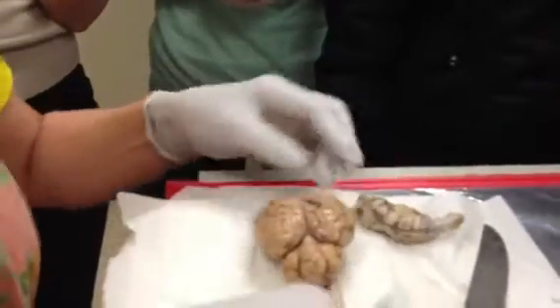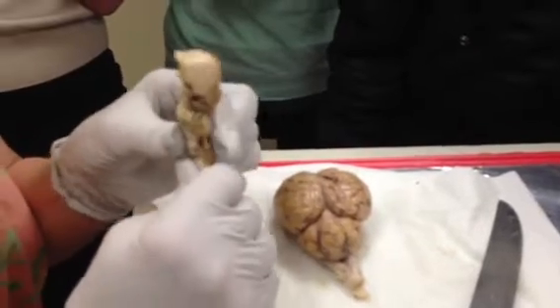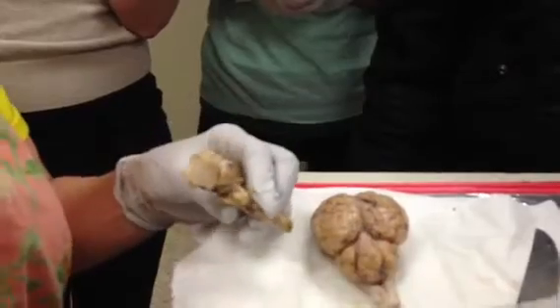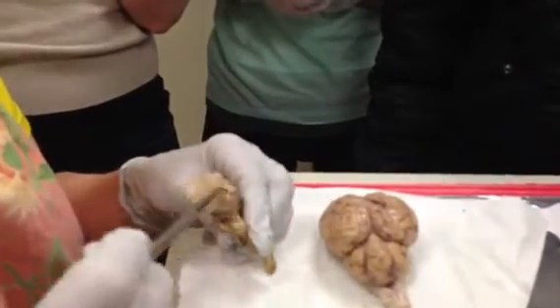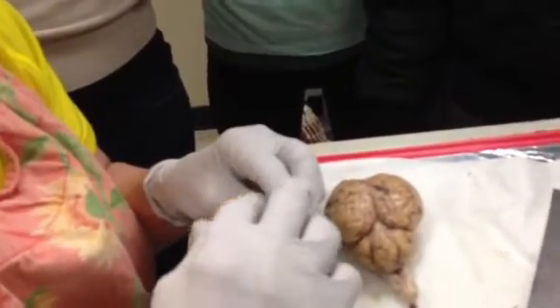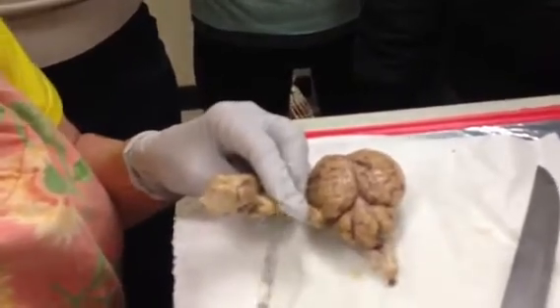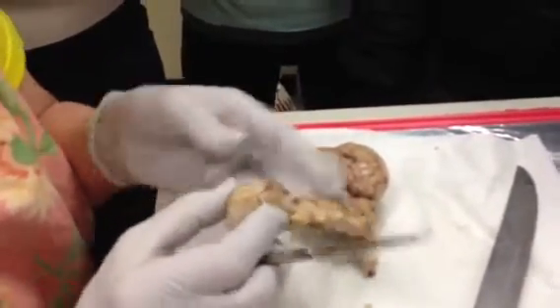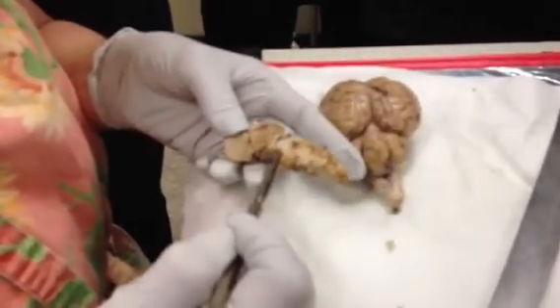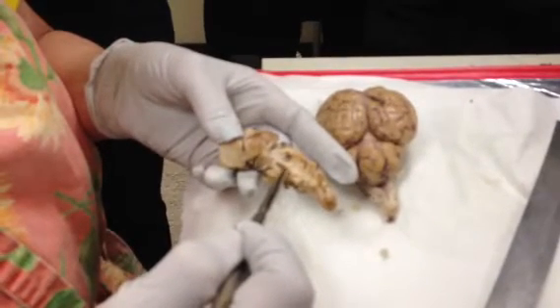Okay. Now the next thing I'm going to do is I'm going to make something that looks like this. This is the cut surface of the thalamus. Right here would have been your pineal body. Would have been. Operative word. Okay. Here's our superior colliculus. There's our inferior. This is our cerebellar peduncle.